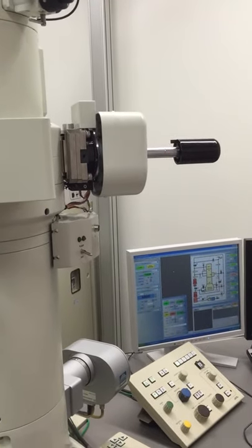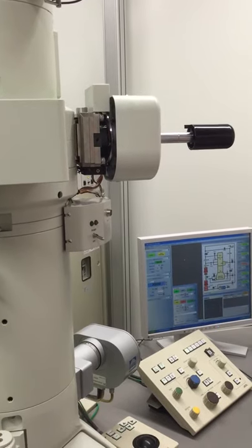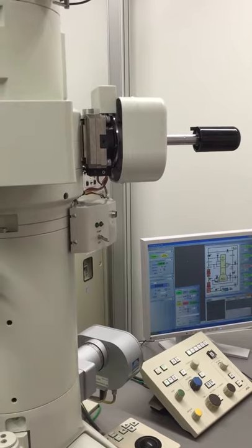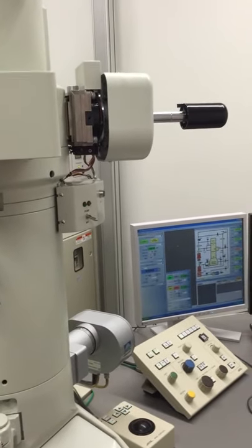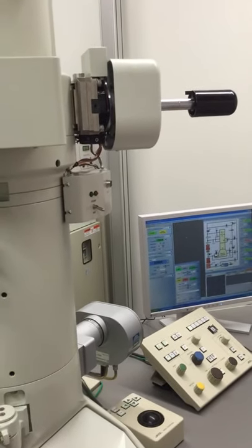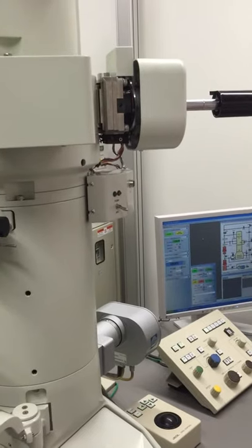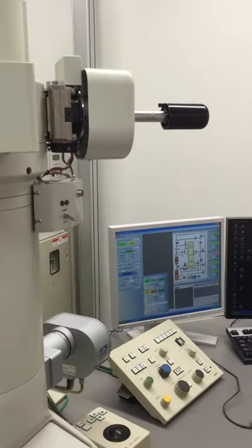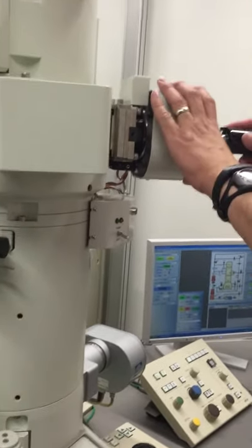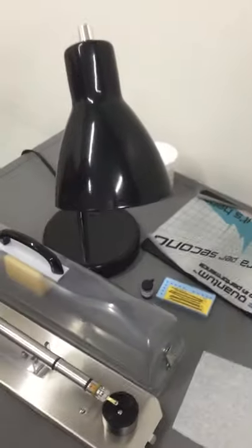I wait 30 seconds and then I move it. It's been 30 seconds so I'm going to take it out. The grid always falls, so it's good to put a little piece of parafilm on the bottom.